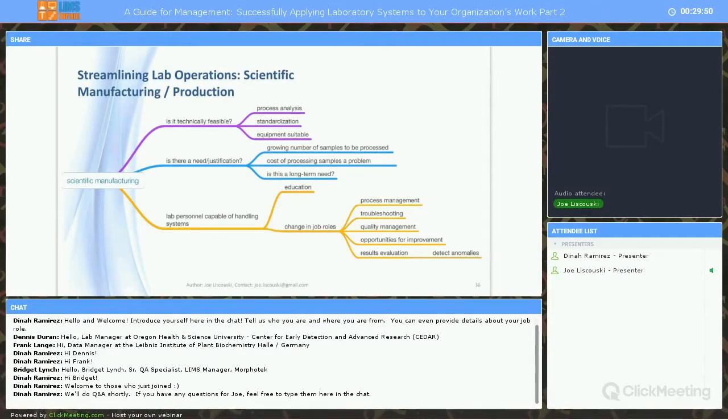If laboratory work is going to move in a direction like this, we're going to have to spend time analyzing systems and preparing people to work in this new environment. That work will start at the development of the experimental process. If the procedures are being considered for automated implementation in the future, the manual version should be designed in a way that the transfer from manual to semi-automated to fully automated is planned for at the start.